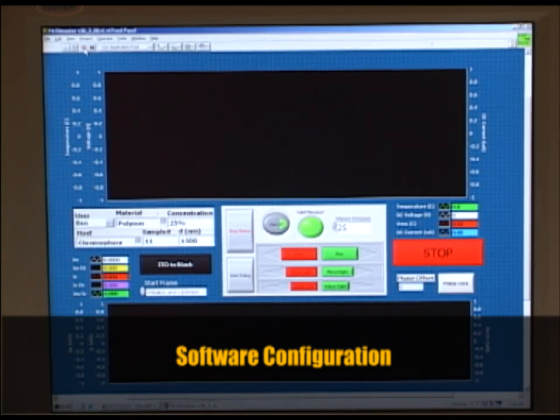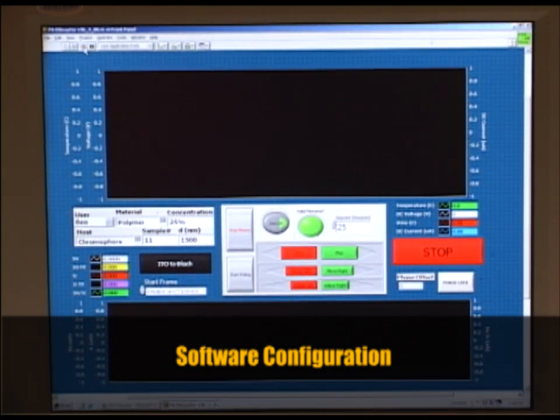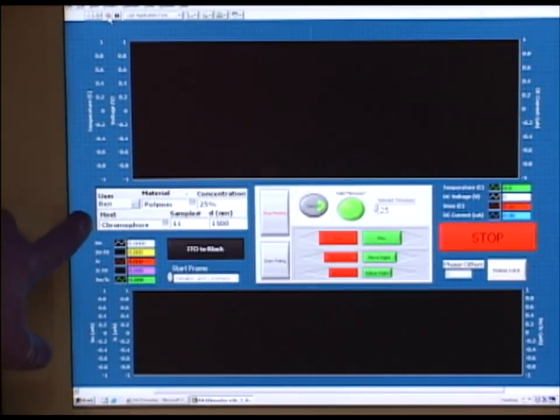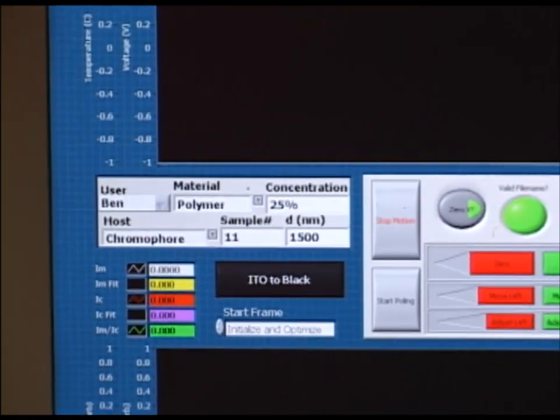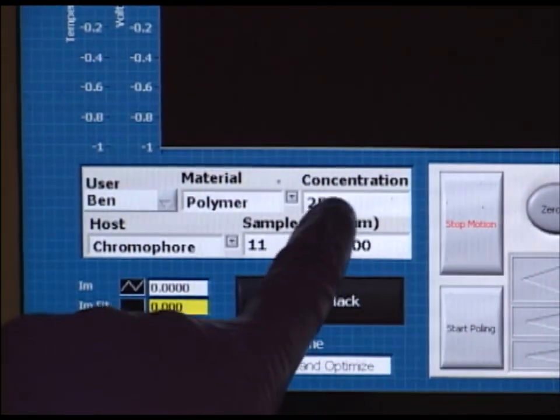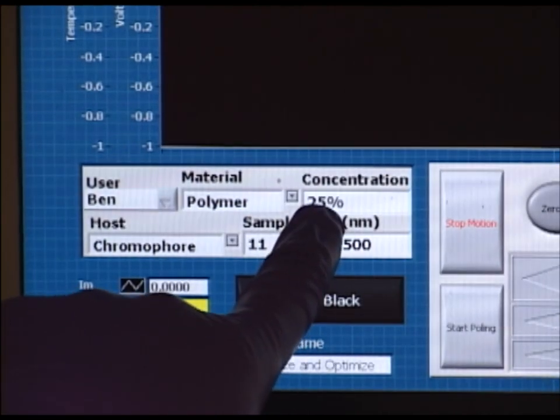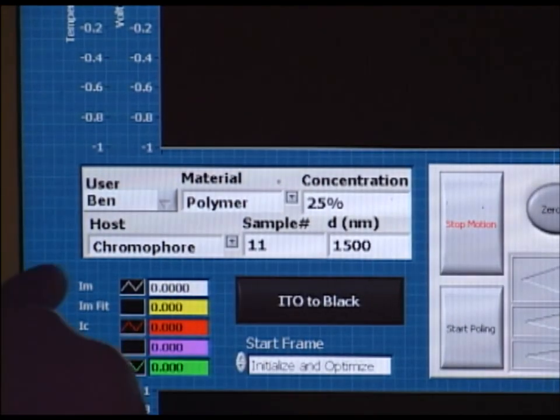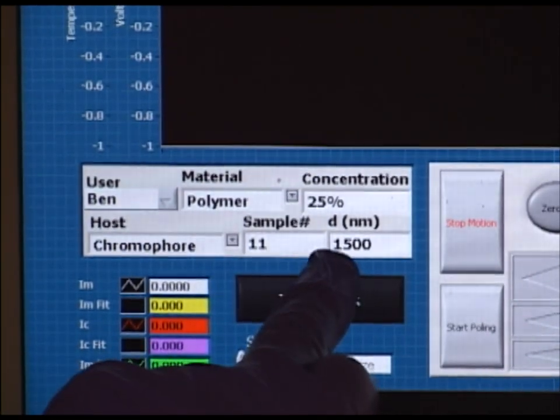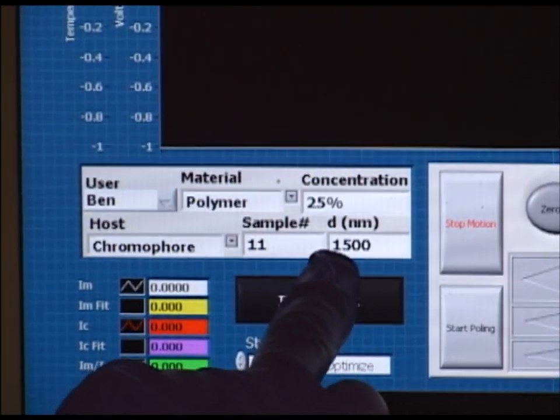The first step is to input the information for the sample into this box here, where it is stored on the computer as an electronic lab notebook. We input the user name, the material, the concentration of chromophore in that particular polymer, the name of the chromophore, the sample number, and the thickness which we've determined using a profilometer previously.